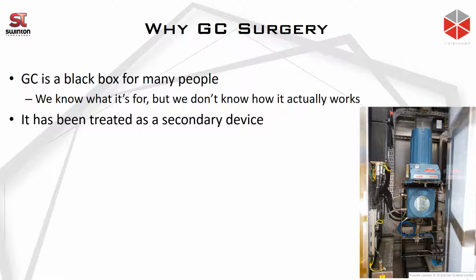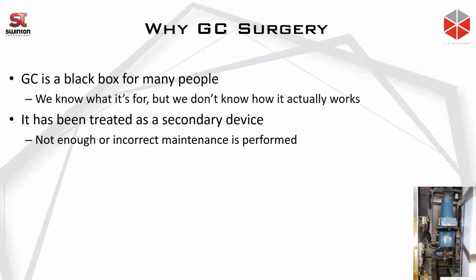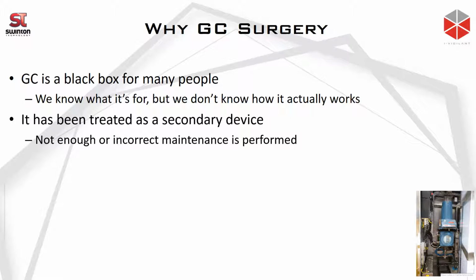So a lot of times it sits in the corner, and not enough maintenance, or sometimes even incorrect maintenance, is performed on the GC itself.